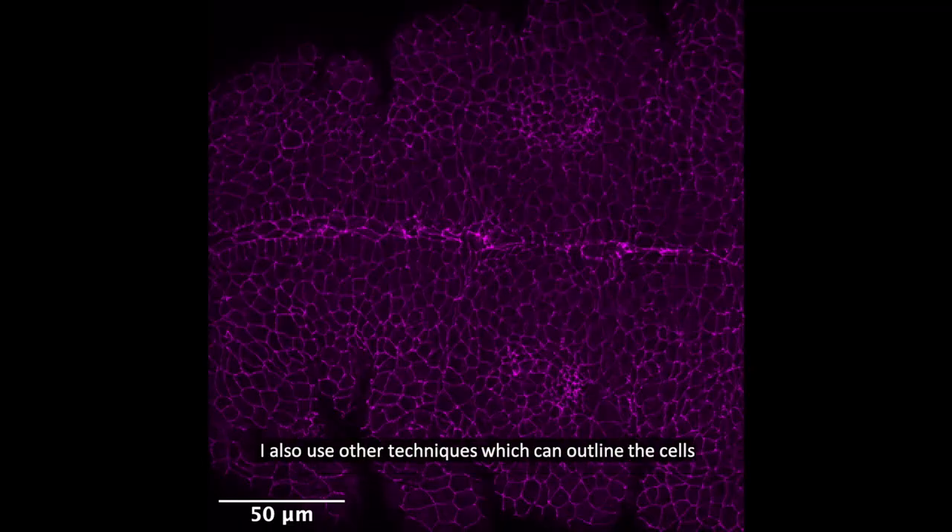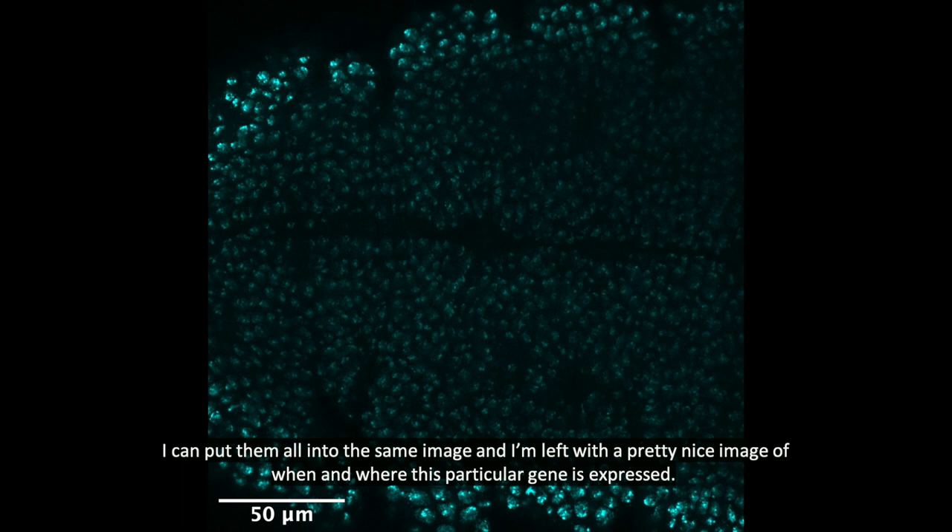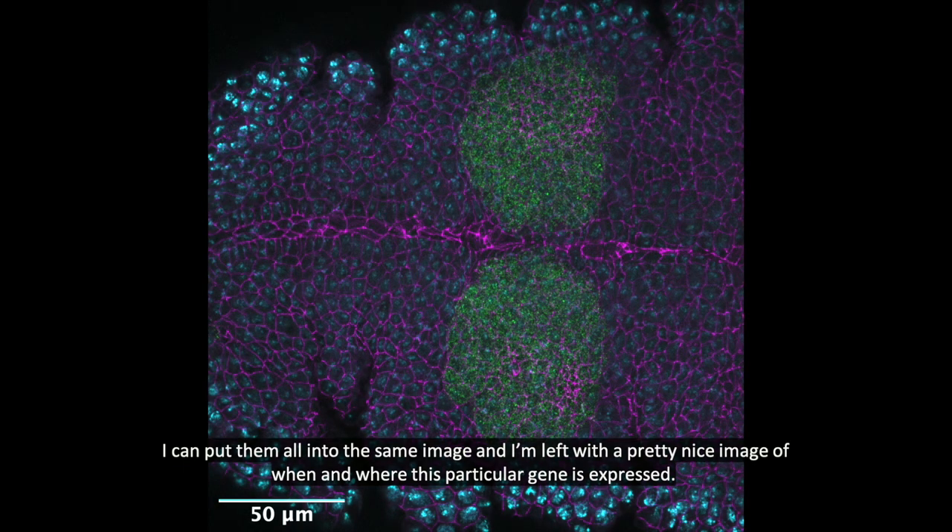I also use other techniques which can outline the cells and also to tag where the nuclei are. I can put them all into the same image and I'm left with a pretty nice image of when and where this particular gene is expressed.